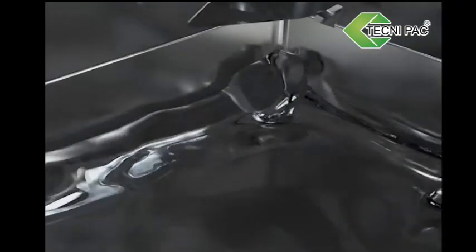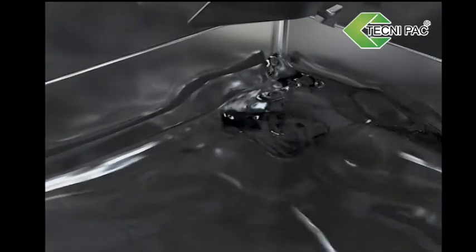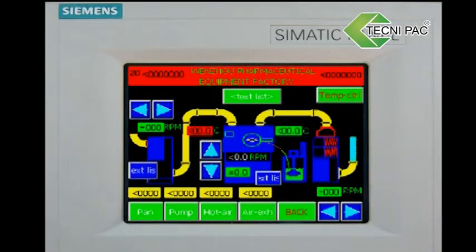Open the pressure pump and corresponding discharge valve to rinse supply water till the water in the rinse tank rises to high level. Then close 80 degrees Celsius water supply valve and pressure pump. Open metering pump of detergent, pressure pump and output pump to supply the detergent. They will close when the detergent is up to the set quantity and time.